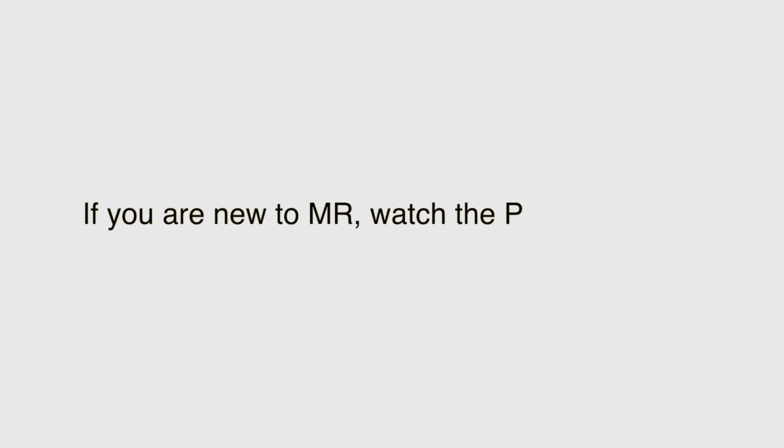If you are new to using molecular replacement, it may be useful to watch the Phaser video tutorial first.